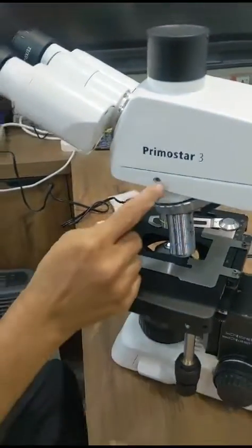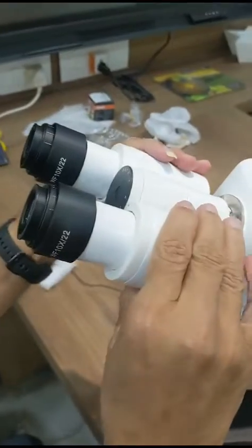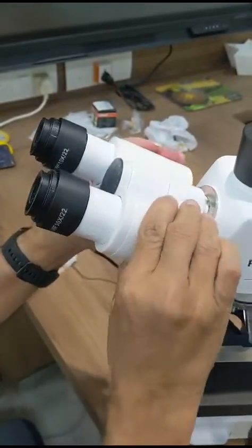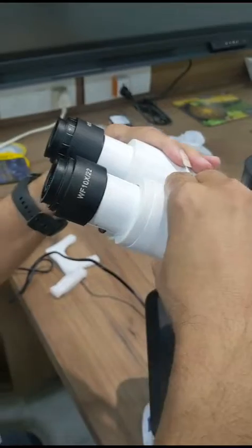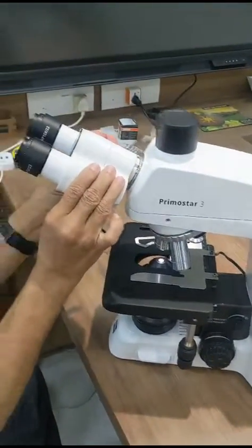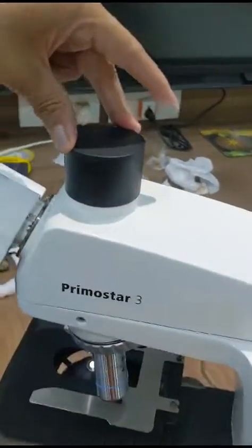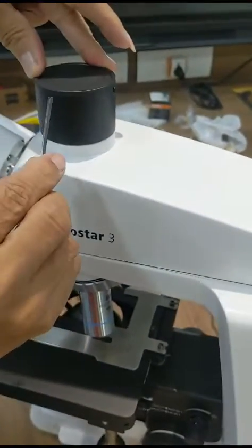That's it — this screw is fixed. This is the binocular; you can change the IPD for taller people. You can also adjust this IPD. This is the trinocular tube.